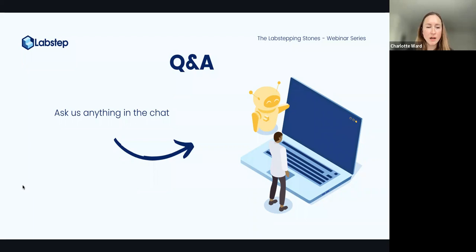Another question is whether installing the package applies only within the script or is saved for future use. I think each time you open a new notebook within Labstep, you'll have to install the packages again, but it is simply a case of having a line at the beginning of your script. You just have to make sure that's there for every script. You don't need it for every cell within the notebook, but each time you do a new notebook, you will need it.